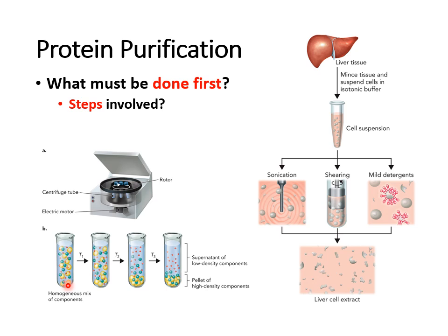You then want to be able to centrifuge it. And so you see here the centrifuge, which always make sure to balance, please. When you put a tube of liquid, let's say on the top side here, across from it you want to put a tube of the same type of liquid, same amount, to balance it out. Otherwise, oh my God, the sound it makes and the way that you can break that machine. But anyway, you then can do this centrifugation to increase the concentration and the purity of whatever protein you're looking at.